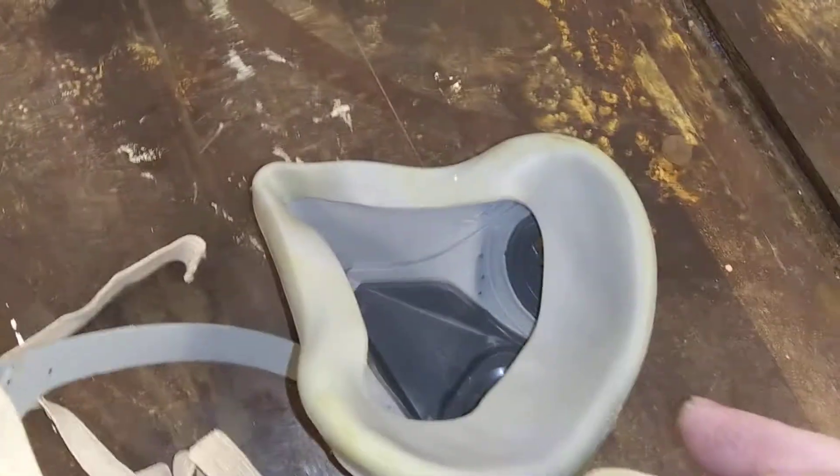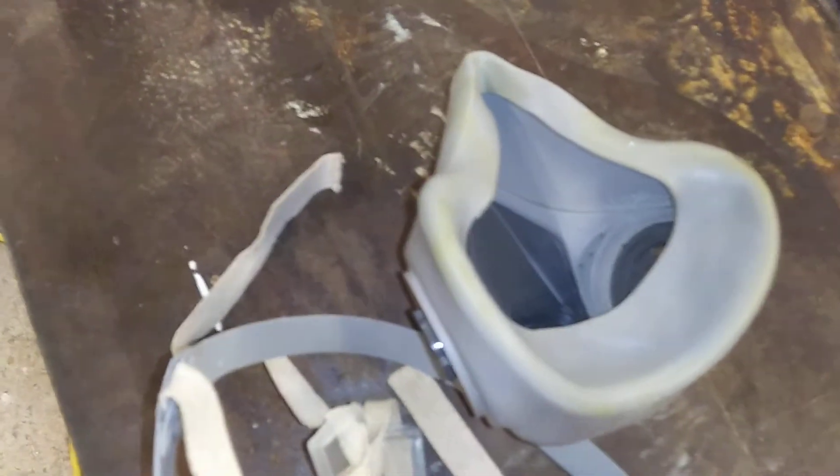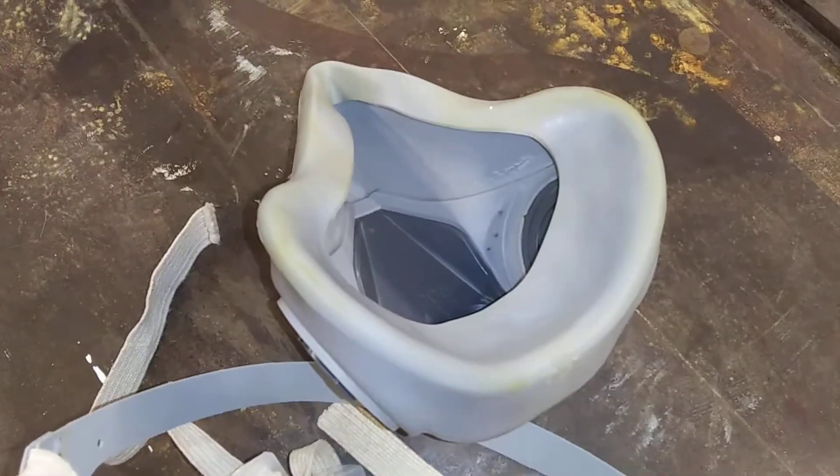Everything you do on this — clean both sides, in and out. Let it dry before you put it all back together. That's how you need to clean this thing. And if you break something, you can order the parts online.